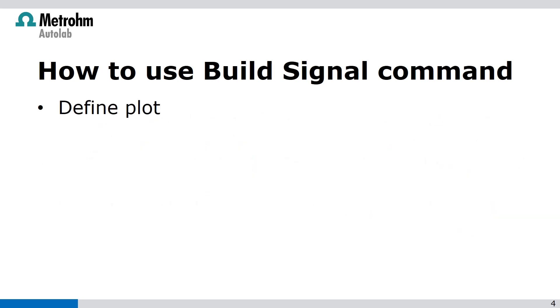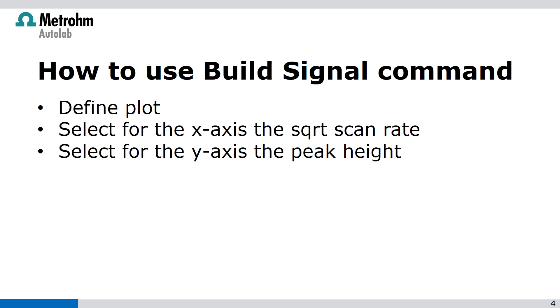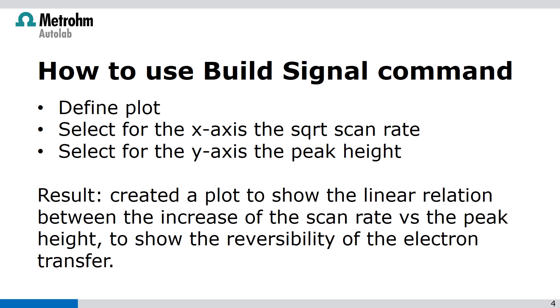Then we have to define a plot, select on the x-axis the square root of the scan rate, and on the y-axis the peak height. Result: we have created a plot to show the linear relation between the increase of the scan rate versus the peak height, to show the reversibility of the electron transfer.